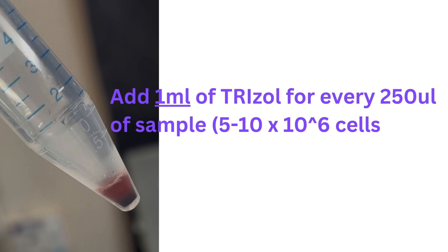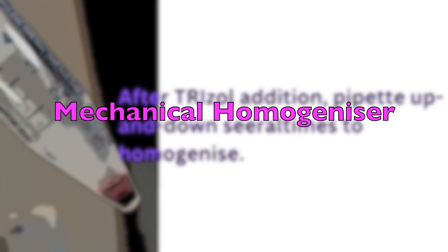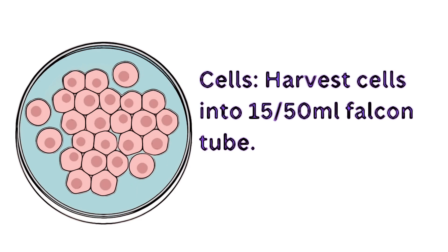It's recommended that you use five to ten million cells for the extraction, so that you can quantify how much RNA you have based on the number of cells put in. After addition of TRIzol, pipette up and down to homogenize the cells several times. If you're starting with tissue, that's also okay, but you would probably need a mechanical homogenizer to first break open the tissue and release the cells before homogenizing in the TRIzol solution.